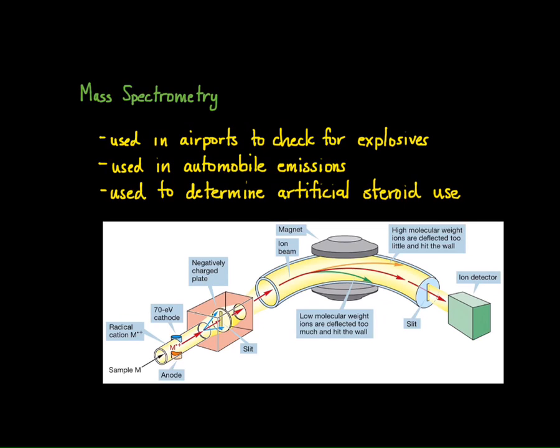We'll really never explore mass spectrometry in that great of detail, looking at molecules that have ionized to a +2 or a +3 or +4 state. We're basically going to be looking at molecules that have ionized once to a +1 charge, and therefore the mass to charge ratio really is the same as the molecular mass.